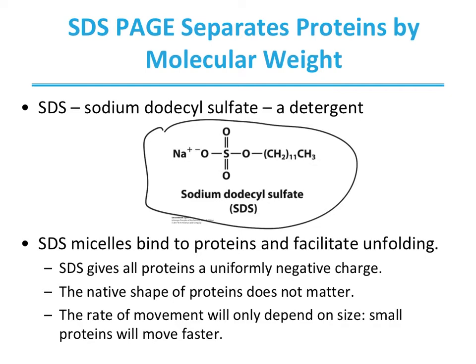Proteins assume a rod-like shape in the presence of SDS, and most proteins bind SDS in a ratio of about 1.4 grams per gram of protein. Notice that SDS has a negative charge. The large negative charge that the SDS imparts will end up masking the protein's intrinsic charge, and the net result is that SDS-treated proteins have similar shapes and charge-to-mass ratios.